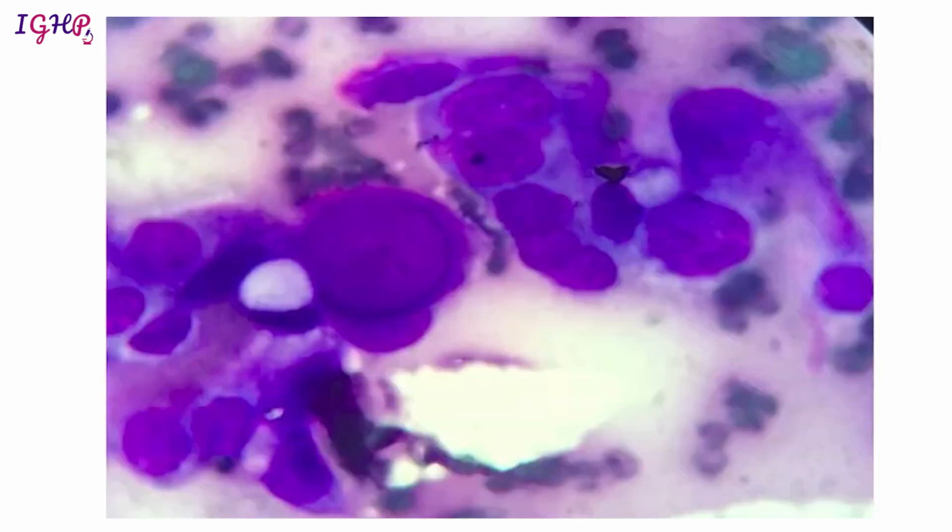Now suppose from the same mass in the head of the pancreas, this is a single cluster that comes on the slide. It looks relatively largely atypical, and there is a large cell over there, but you are not able to call it definitely as malignant because the cellularity is very low, and that is preventing you from calling it as a definite malignancy, but in the back of your mind you are still thinking that it could be malignant. So this is category 5 lesion in which it is suspicious for malignancy, but you are not calling it as definitely malignant.